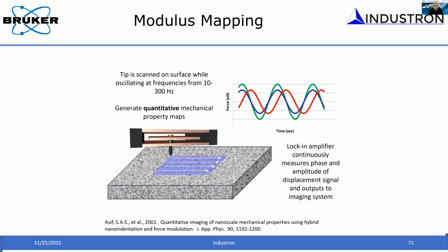What is the second question? What other characterizations can we perform on metal ceramic composites using a nanoindentation instrument? Other than what I already mentioned in the first webinar about measuring fracture toughness, you can do that by measuring the crack length. That is other than hardness and modulus.